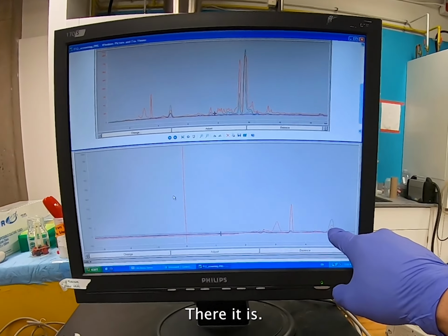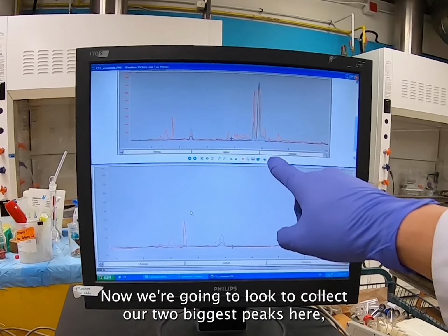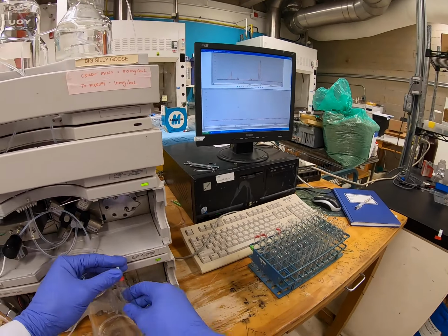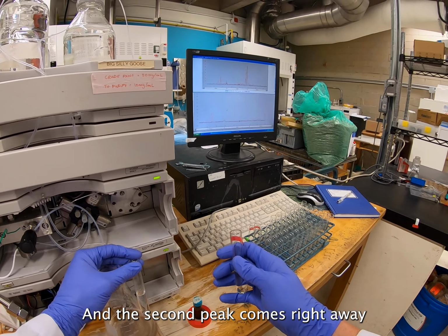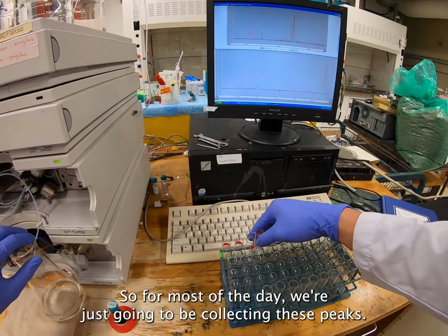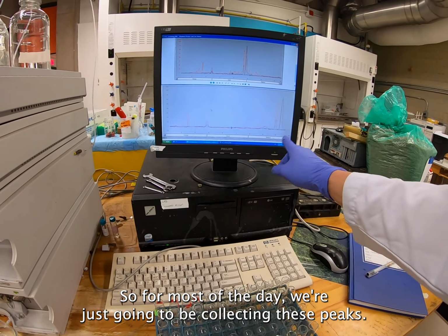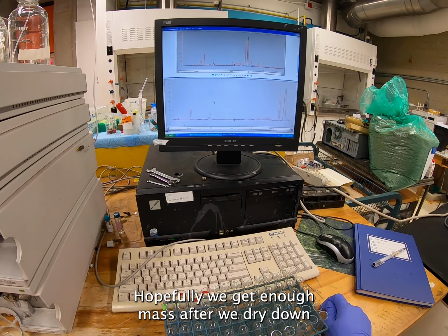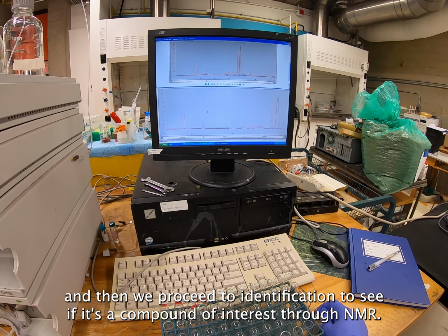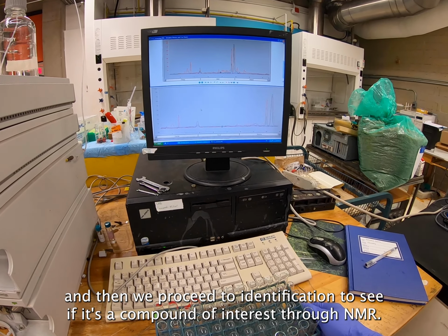And there it is. Now we're gonna look to collect our two biggest peaks here. They should be coming out soon. And the second peak comes right away, so you gotta collect it. So for most of the day, we're just gonna be collecting these peaks. Hopefully we get enough mass after we dry it down, and then we proceed to identification to see if it's a compound of interest through NMR.